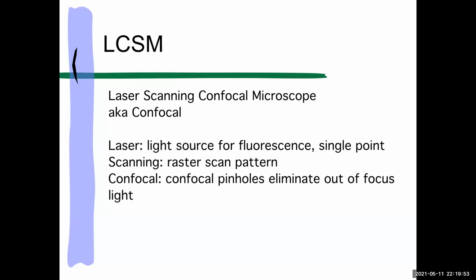So this is interesting. It's a huge difference in operating the scope because you've got to think about it in terms of you're doing a point scan, literally a point at a time. You're not just opening a shutter and going, let me see what's there. Let me illuminate the whole specimen. Let me get all of the signal. That's wide field microscopy. With confocal, it's going to take longer because you're pointing the laser to just one part of your specimen and then to the next and the next and next until you're carefully getting everything from the one plane of focus, and then you're going to step down to the next plane of focus.